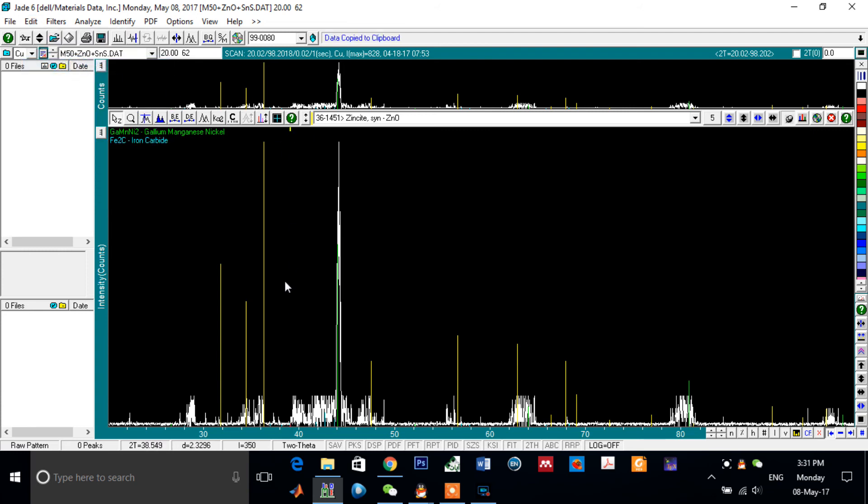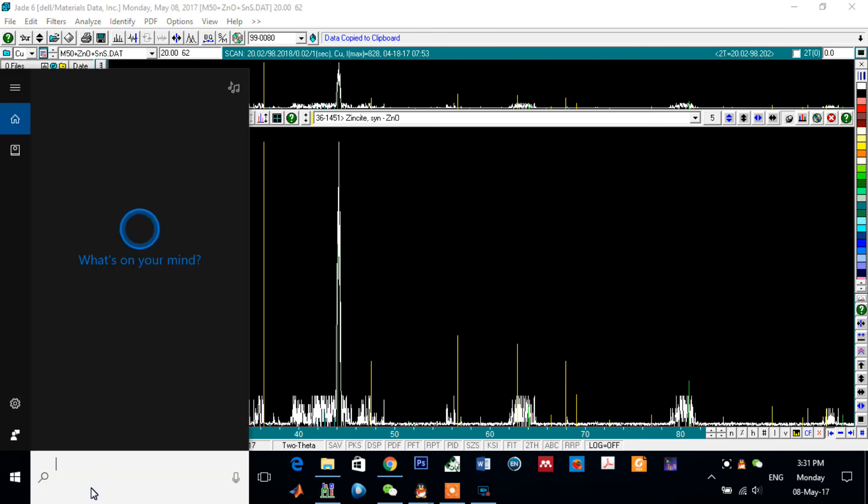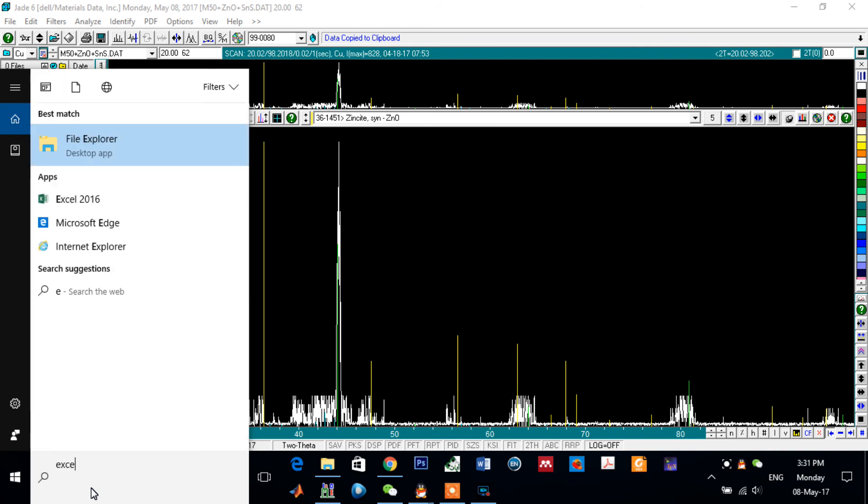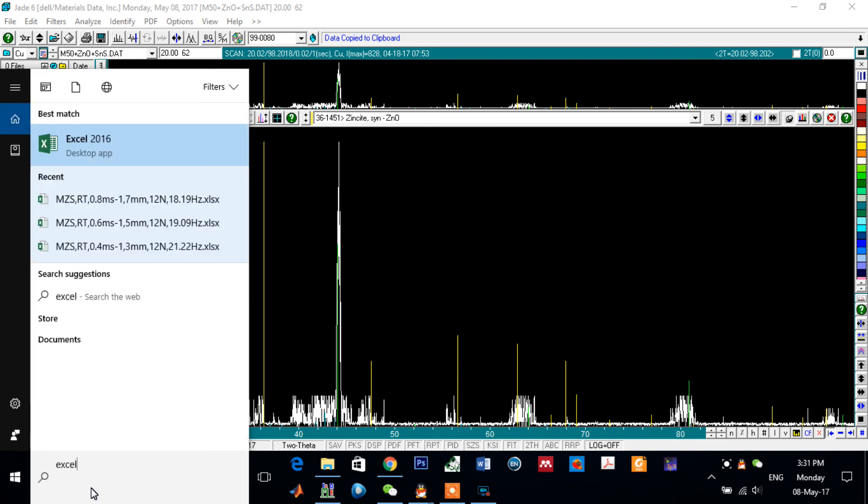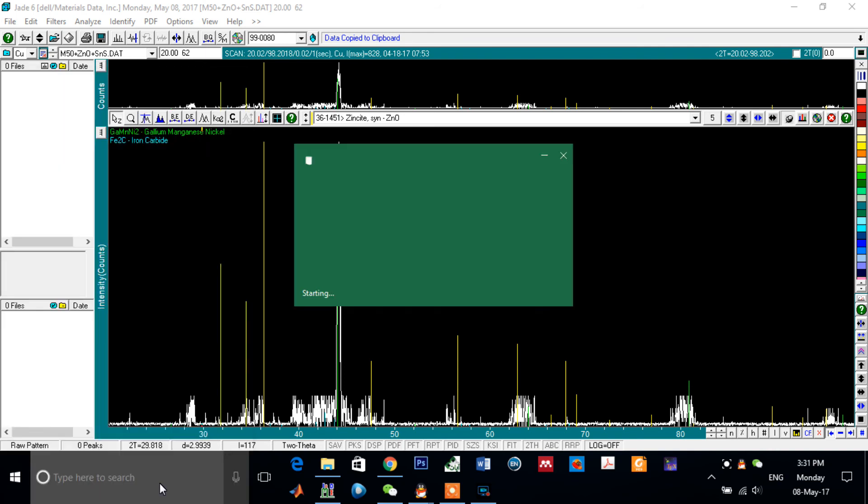Now the data of your sample are copied. Now go to, for example, to Excel or the Origin or the software you would prefer to draw your sample.